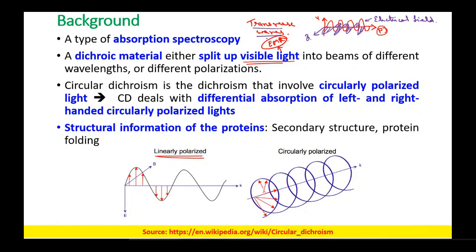And when we talk about this, suppose we have a bulb through which the radiation is being generated. So what happens over here? In this case, the light is moved in all directions.